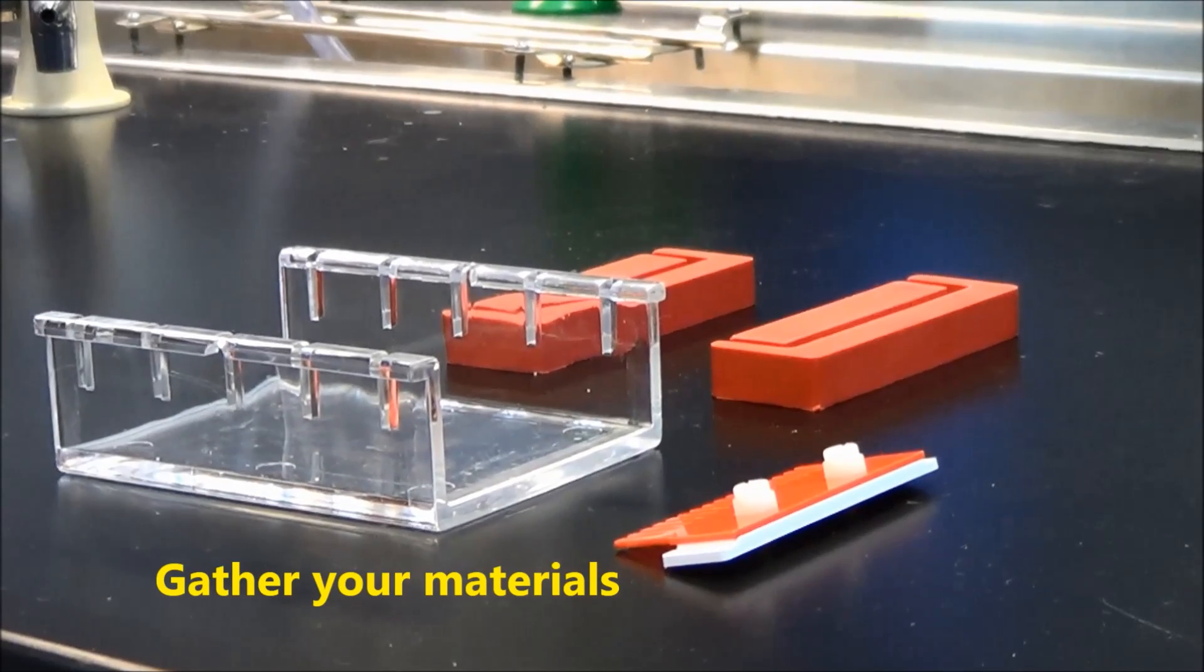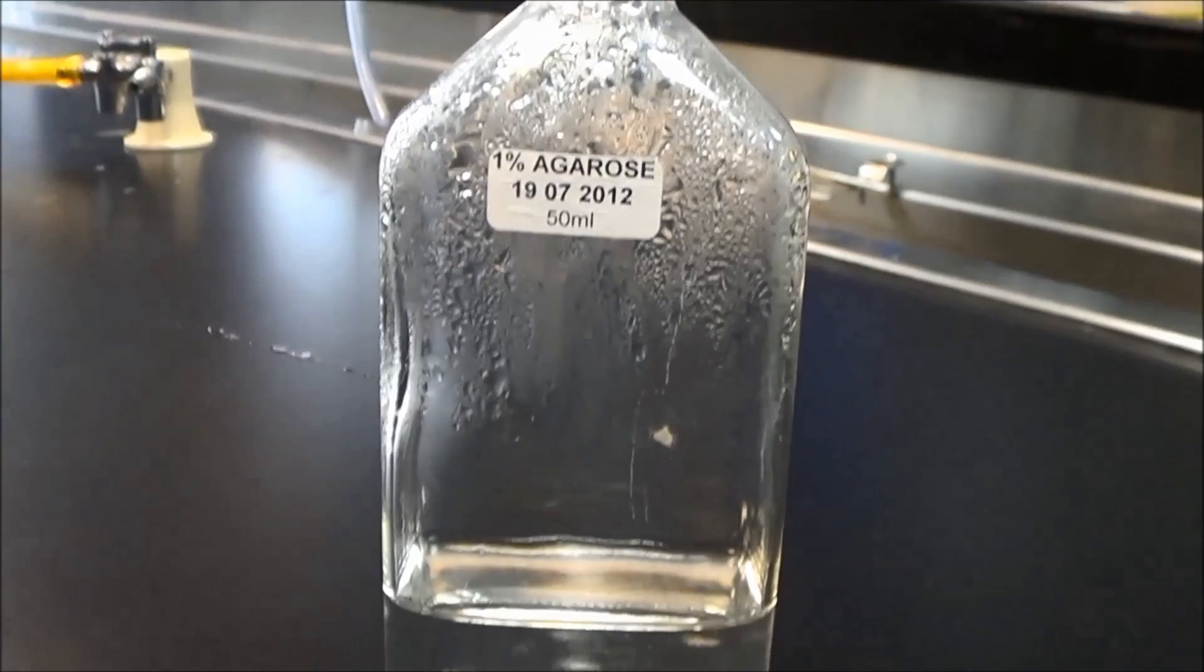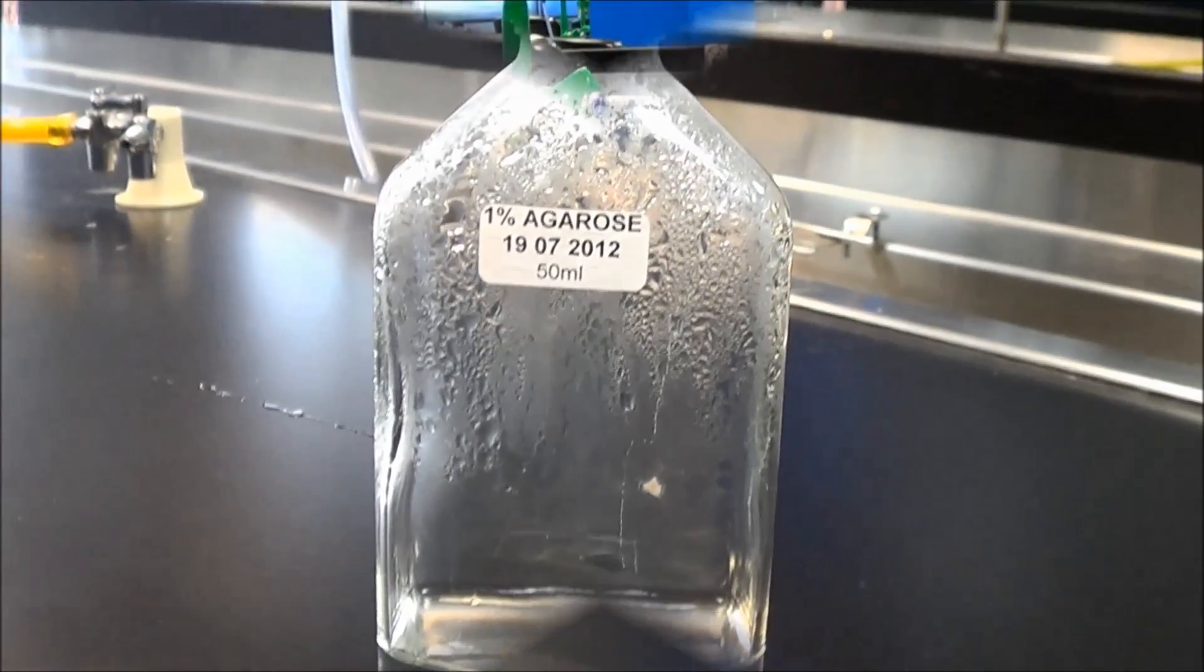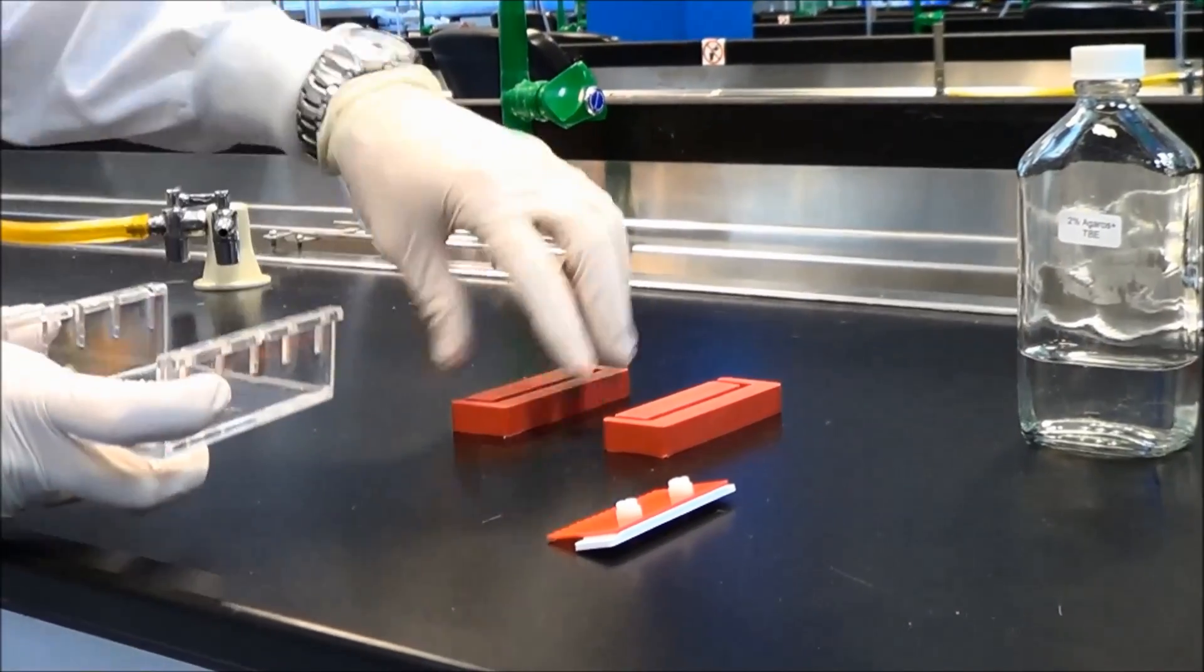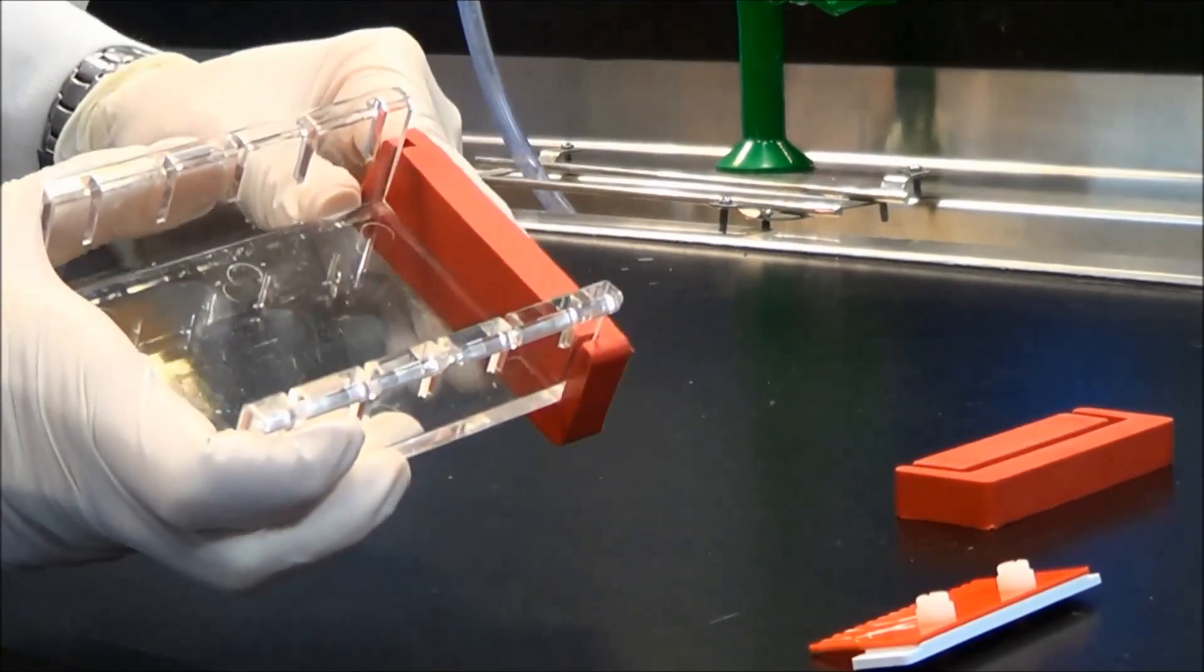Gel electrophoresis setup. To set up an electrophoresis gel you need to firstly gather the following materials as shown. Place the casting dams together like so and insert the comb as shown.